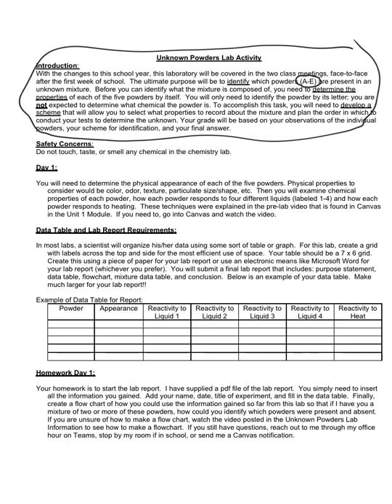This lab, while it's fairly straightforward and very rudimentary, will still do the basis of the same thing. We're trying to identify an unknown by knowing properties of individual pure substances. Okay, so let's turn the page.